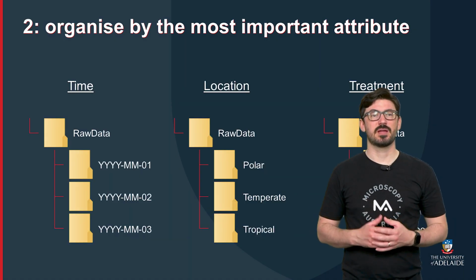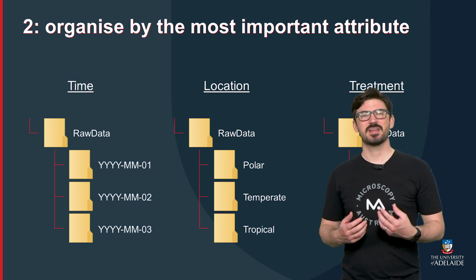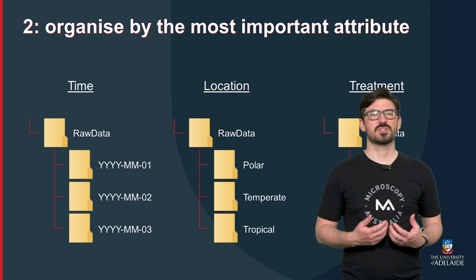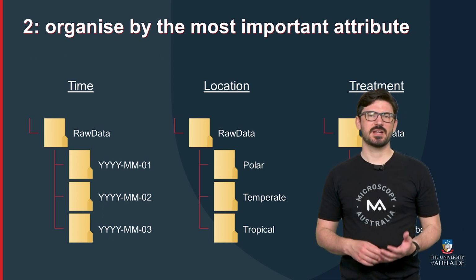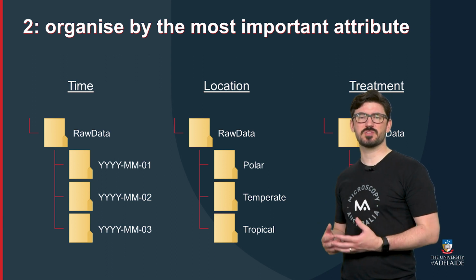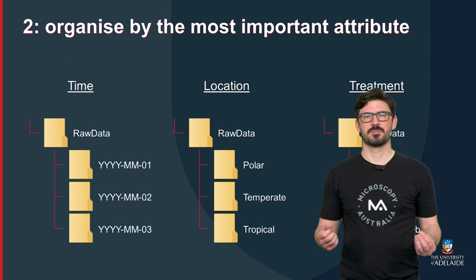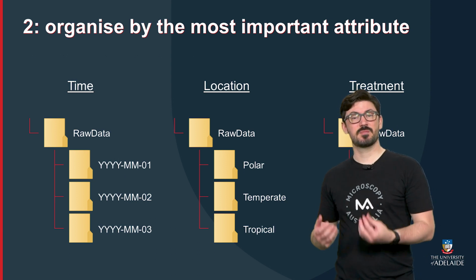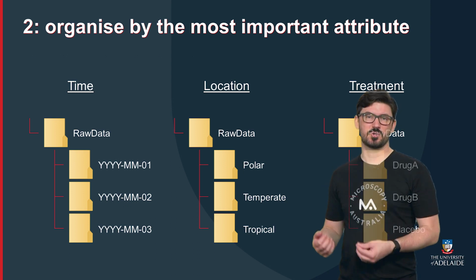If, however, you create many hundreds of images, then option two might be for you. And that is saving images in subfolders as determined by the most important attribute. So in module one, you identified and sorted the most important attributes for your data, and we saw that it was beneficial for default sorting your files. Subsequently, we create subfolders per the attribute values and save image data in each folder accordingly.